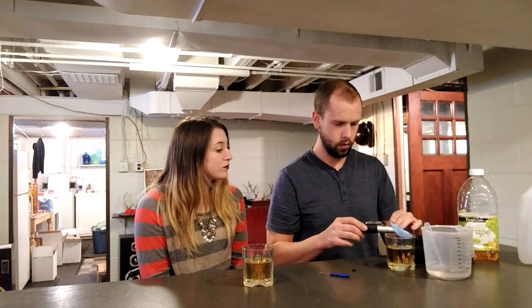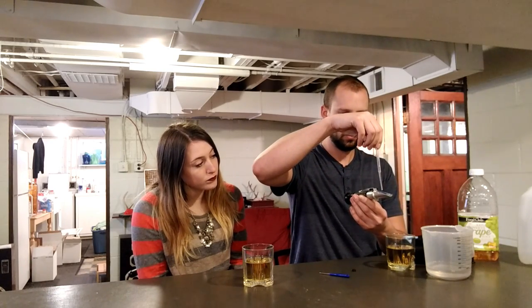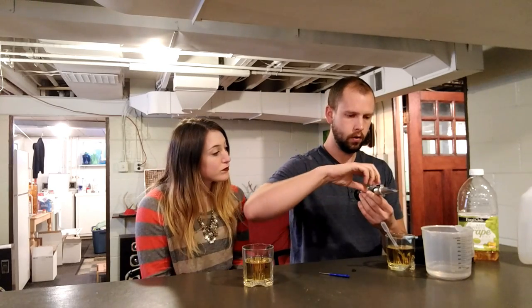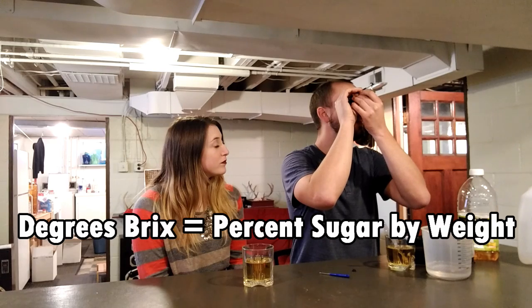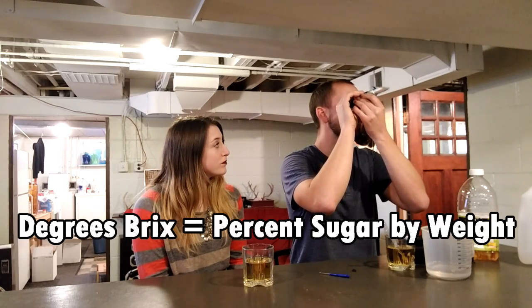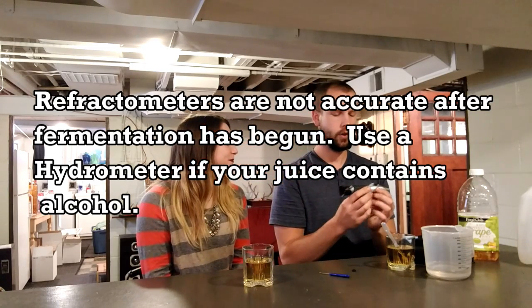Now let's wipe it, squirt that out, suck up some juice, put two or three drops on, hold it up to the light — fifteen point two five percent sugar in the juice. And that's all there is to it if you want to measure how much sugar is in your juice. That was easy.